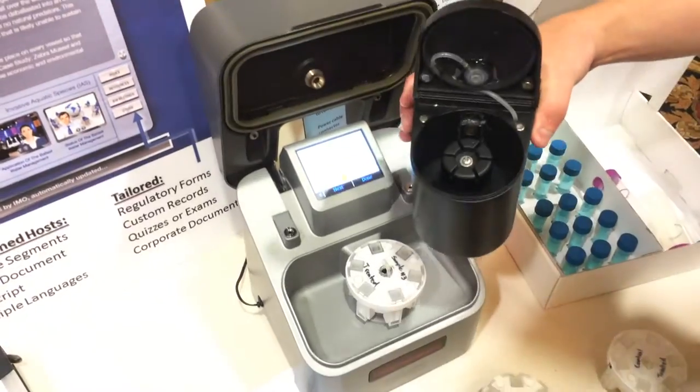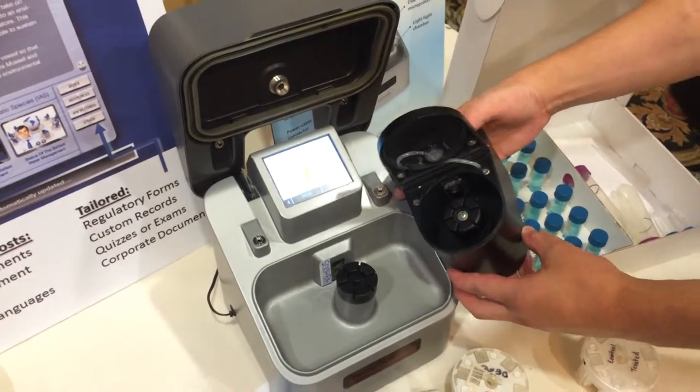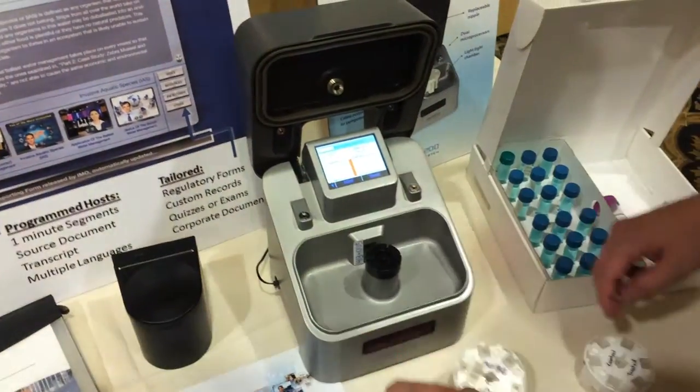This cartridge fits in there just like that, and this camera is identical to the camera on the back of the larger unit. It's just a smaller lab version, or even a field unit if you have a laptop.